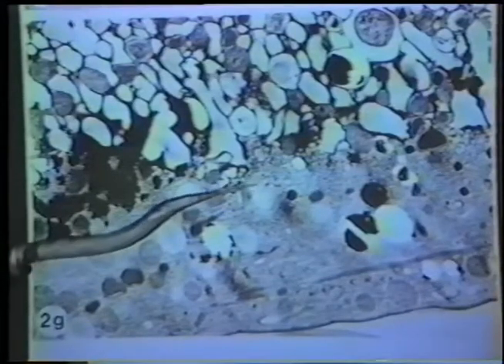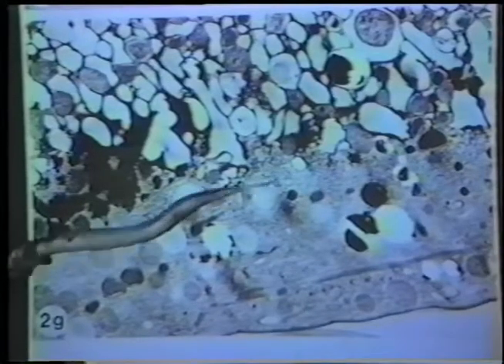This cell was not. And you can see this region near the surface was reasonably well preserved. And as you go deeper into the cell, the ice crystals start getting larger and larger. You can see that the clear spaces are where the ice crystals were, and everything else is the eutectic, the reticular network. Then there's a very sharp boundary here. Now, this is not what one typically sees if the freezing was bad to begin with. I would expect to see a progression of ice crystal sizes continuing from here on back, if the freezing were bad to begin with.